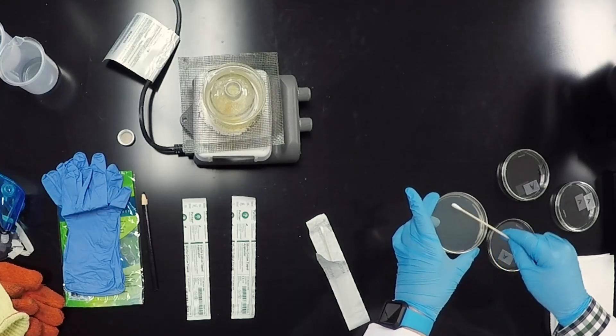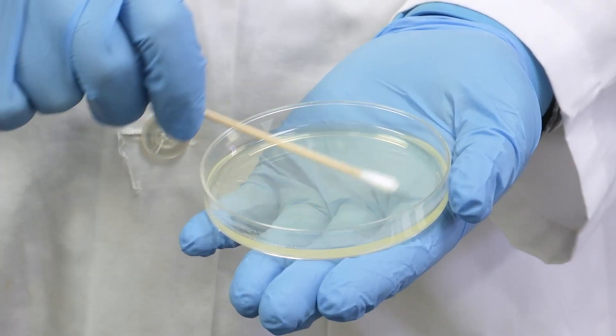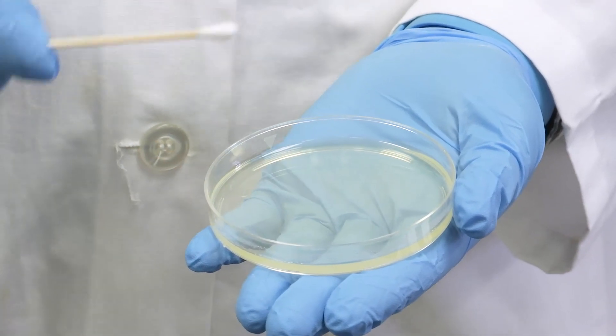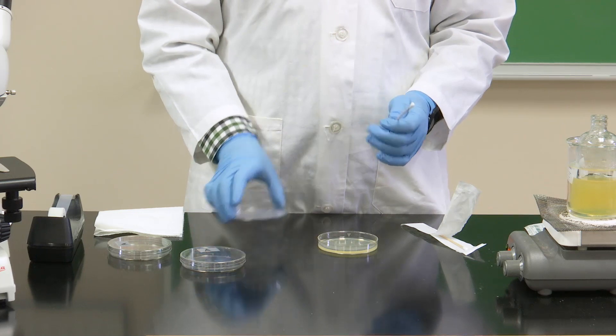Now take your swab and wipe it in a zigzag pattern across the agar gently. You do not need to press hard. As long as they make contact, it should be fine. Now, cover your petri dish with its lid and tape it shut. Do not open it back up after you do this.